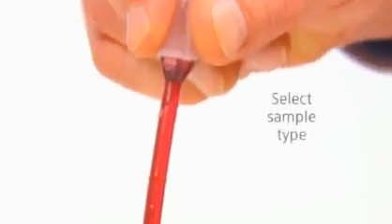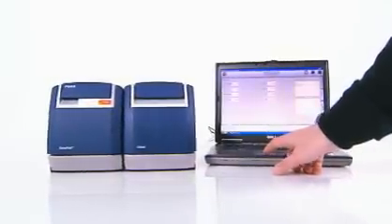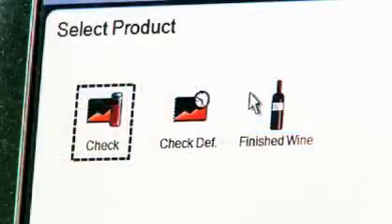To do a test for color and wine parameters, select an icon on the computer screen to match your sample type. In this case, we'll choose finished wine.